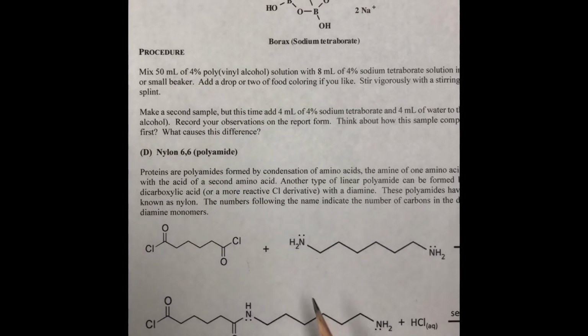Hello. The next polymer we'll look at is called nylon. Nylon involves the condensation of two different subunits. One is a dicarboxylic acid chloride called adipoyl chloride, and this is much more reactive than a carboxylic acid or ester. The other reagent is this 1,6-hexane diamine, two primary amines, each on the terminal ends of a hexane unit.